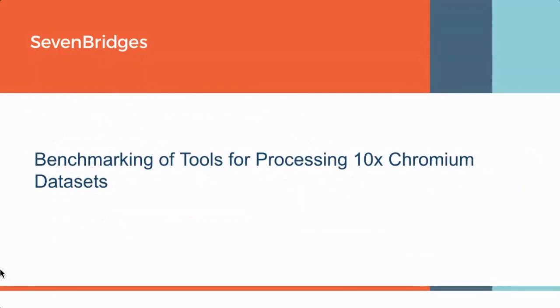Okay, so now that we have gone through the tools and packages available for single-cell analysis, we will present some examples and demonstrations of how they perform. And first, we'll present the results of comparative benchmarking of different tools for processing 10x Chromium datasets.